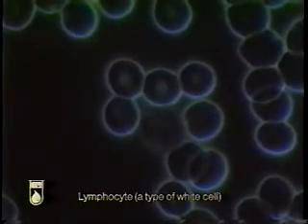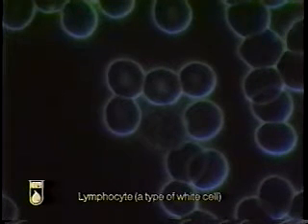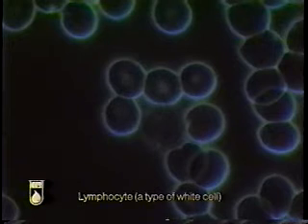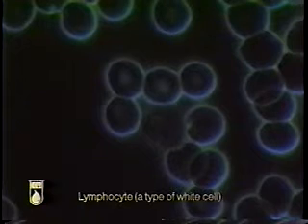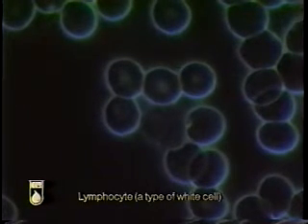The cell near the center of the screen is a lymphocyte, one kind of white blood cell. It comes in several subspecies or varieties. Some of these varieties are responsible for producing antibodies or the globulins that protect us from bacteria and virus. Other subspecies are responsible for actually going out and attacking foreign materials that are toxic or noxious for our system.